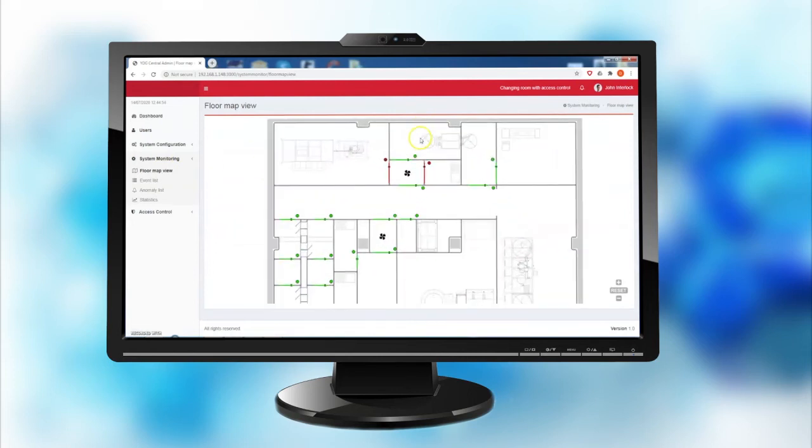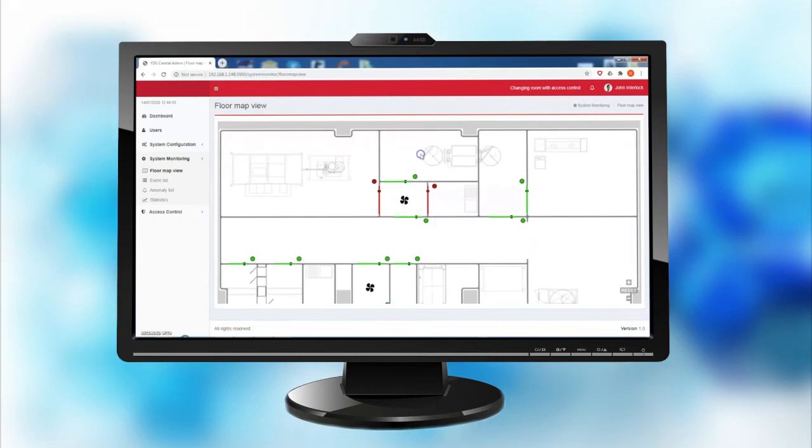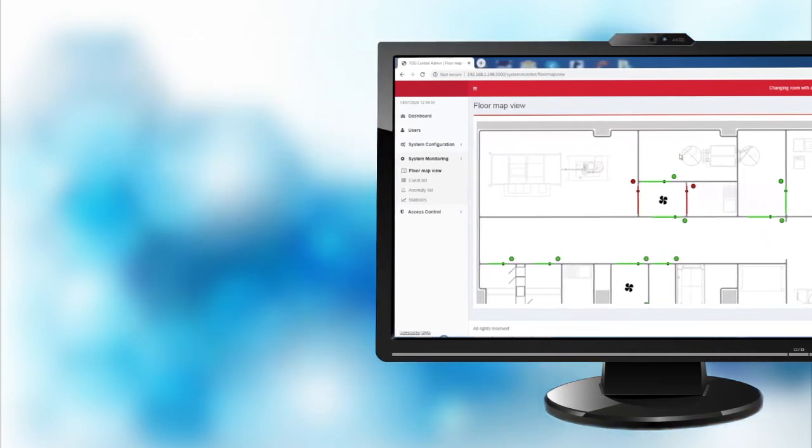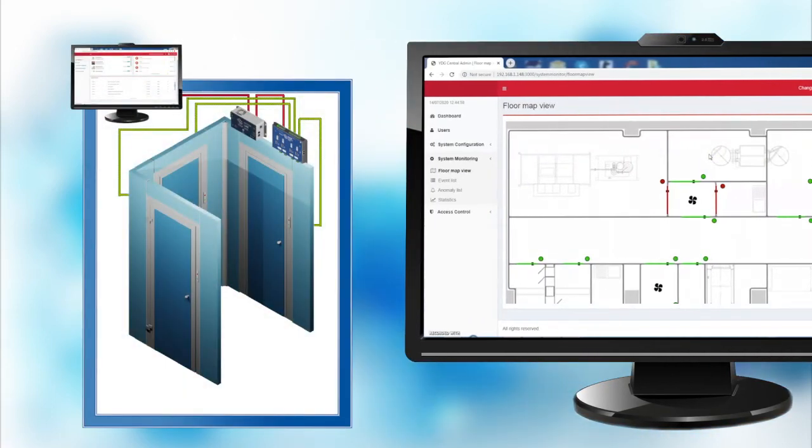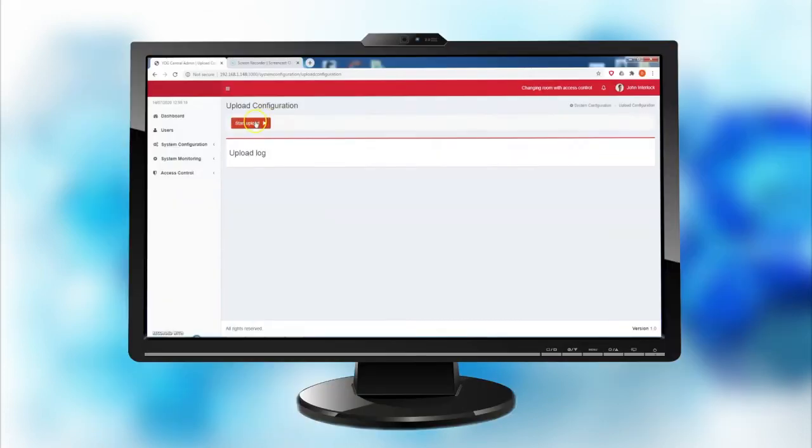The pre-configured functions which define the door parameters and the interlocking relations between doors may be saved into a library and easily activated by the upload icon.